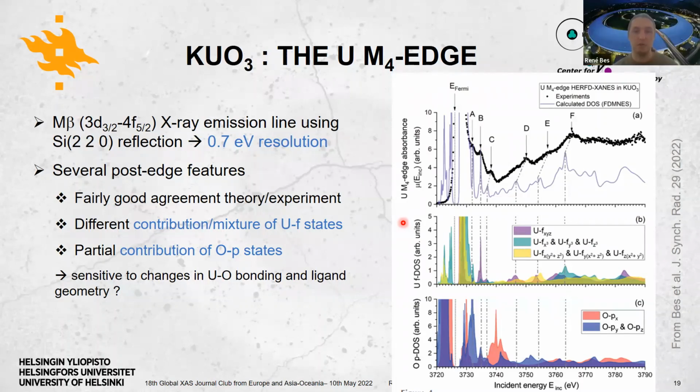Well, if you want to very well understand the electronic structure, you need all three, and in the perfect world, you would need also to have something able to measure the S state as well, so to have a complete overview. Nevertheless, most of the time, F states and D states are the most common. So L3 and M4 HERFD would be the must-have in the sense that they will be the most prominent in what is happening nearby the Fermi level in the bonding. The P states measured by measuring L1 would be a kind of a bonus and will give you more insight, but they should be secondary. And the problem with the resolution, which is still not very good, is still a problem. So M4 and L3 would be quite the must-have, I would say.